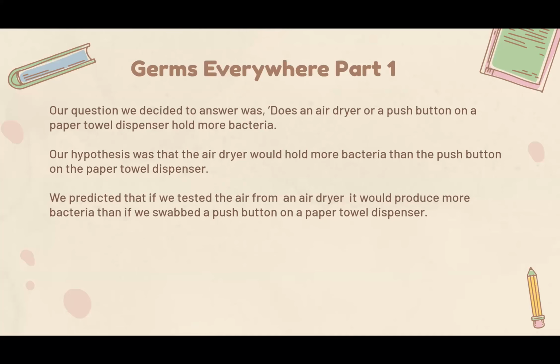Our experiment idea originated from a TikTok where a man tested multiple public bathroom air dryers for how much bacteria they hold. So as a group, we thought we should do something similar at North Carolina A&T. The question our experiment was based off was which hold more bacteria, the push button on the paper towel dispenser or an air dryer. We hypothesized that the air dryer would produce more bacteria than the paper towel dispenser push button. We predicted that if we tested the air from the air dryer, it would produce more bacteria than if we swabbed a push button on the paper towel dispenser.